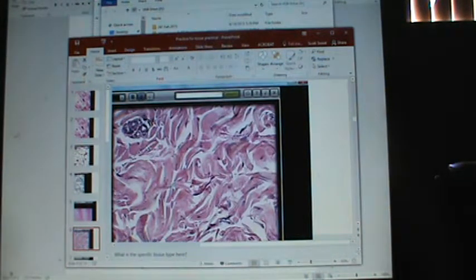Looks like something you'd want to have on your wall of the bathroom. So pretty. Look at that nice thing there. So major tissue type? Connective. Specific tissue type? This would be called dense irregular. This is the kind of thing that you'd find on the knee capsule. Has fibers going in many different directions like that, so it's able to expand and contract like elastic for protecting the joint. So, dense irregular. So let's go on.